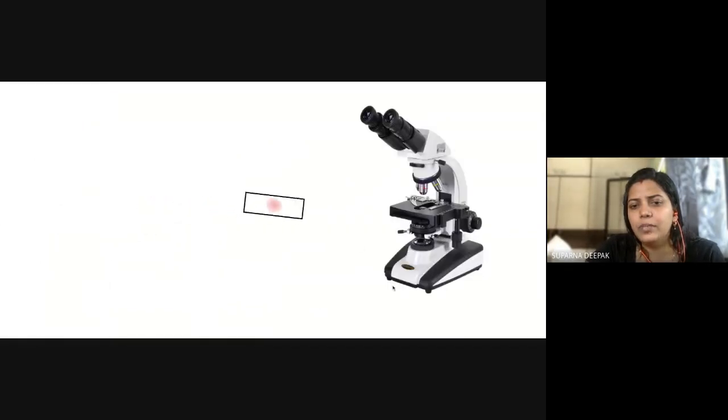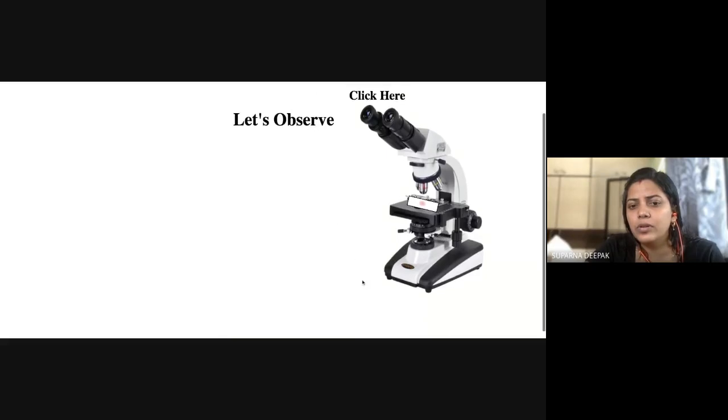And then we will mount it onto your microscope. Okay, so then you can observe and you will see that kind of picture which I have already shown to you. Am I clear, students, everyone? Yes, ma'am. Is it very much clear?